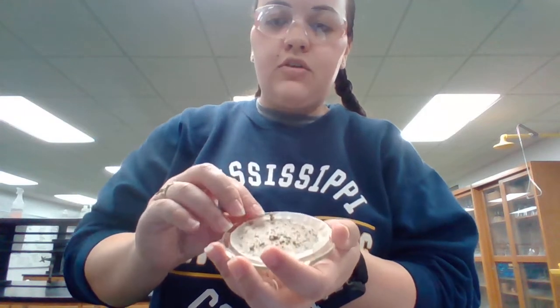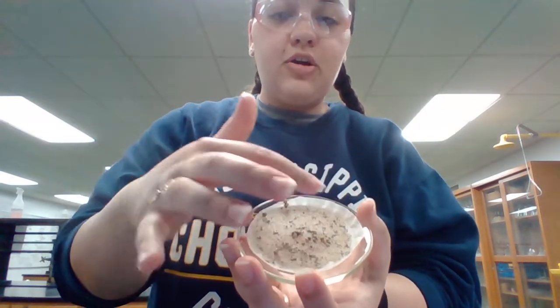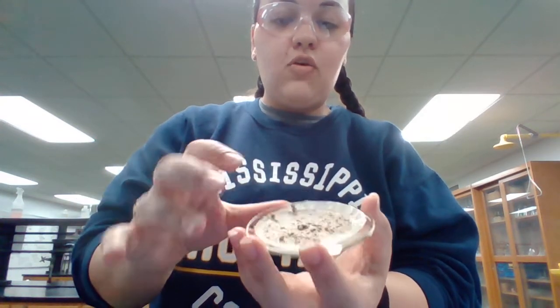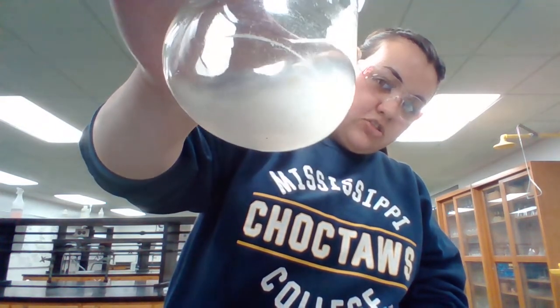Okay, and of course you can put your filter paper in the garbage, and that filter paper will have the large particles. So I'll show you what that looks like. This was after this first filtration, so I have all the large particles that wouldn't go through the funnel on my filter paper. And then in my beaker, I'm going to pour the liquid from the filter flask back into the beaker. And now you can see that my solution is still cloudy, but I don't have any of those large particles in it. And this is what we want.